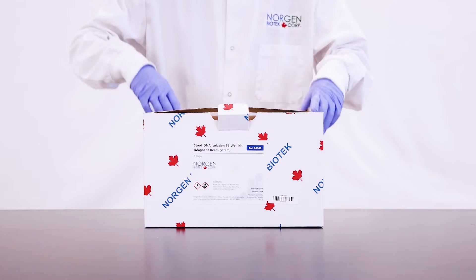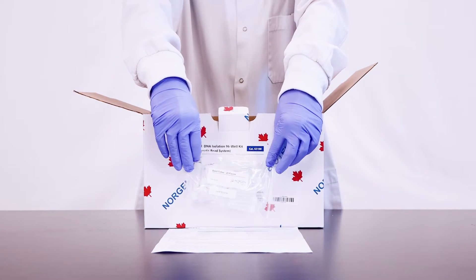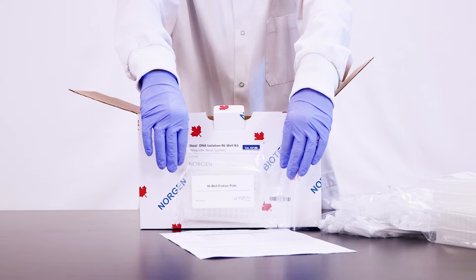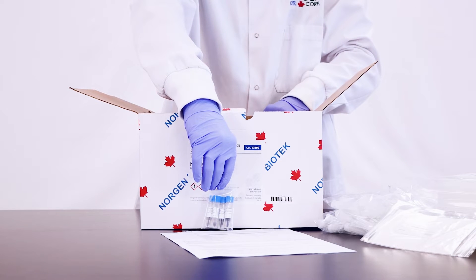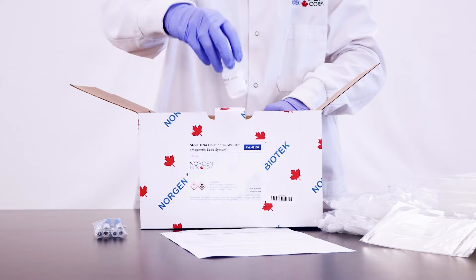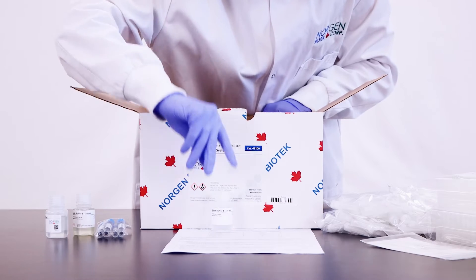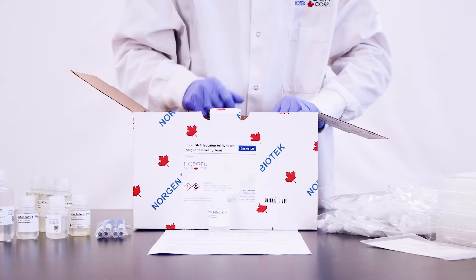Upon opening the kit, you will find a detailed product insert, bead tubes, two 96-well plates, two 96-well elution plates, adhesive tape, four 1.1-milliliter tubes of magnetic bead suspension, lysis additive A, lysis buffer L, elution buffer B, solution WN, and binding buffer I.